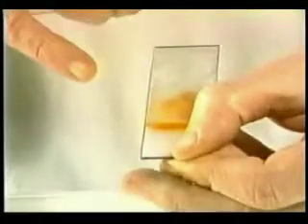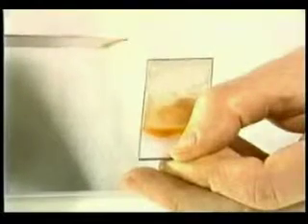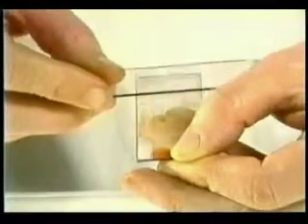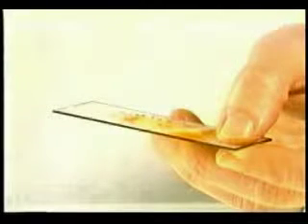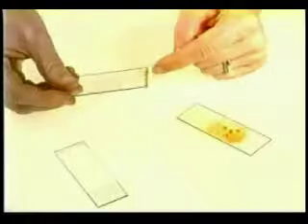At this point, the tilt of the bottom slide is increased to get rid of as much of the fluid as possible, and then a smear is made using the basic technique described above. Take care to limit the smearing to the stranded fragments. If the smearing includes the material at the frosted end of the slide, fluid will be mixed back in and dilute the specimen. Also, make sure that the bottom slide is tilted toward the frosted end throughout the whole procedure, or the fluid will run back over the valuable fragments.